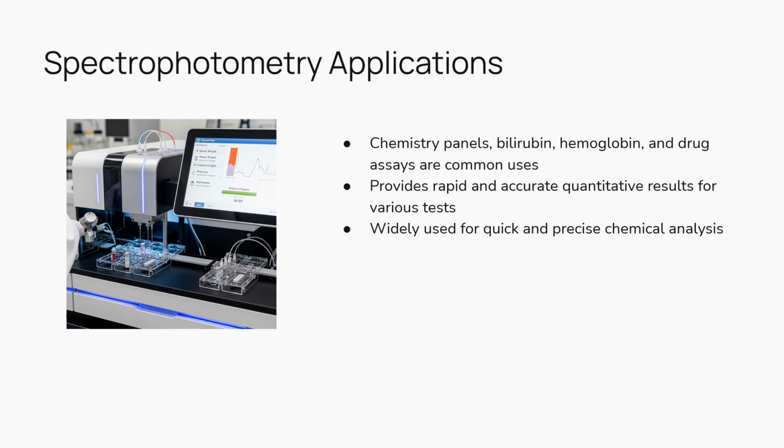reaction. Some advantages of spectrophotometry are that it is rapid and precise quantitative analysis. It is non-destructive and cost-effective. It has a wide applicability in clinical chemistry, environmental testing, and pharmaceuticals. And it is suitable for routine automated testing.